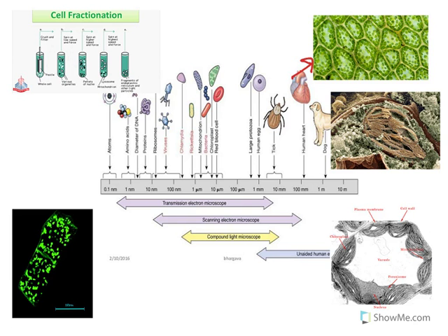The microscopy you're used to, what we use in the labs, is this light microscope. What that does is it just puts light through the sample, and you have kind of a magnifying glass, and you're able to see what's there. It's not very detailed. As you can see, this is the limit of the light microscope. So when we're looking at cells, you can't really see the details inside of the organelle.